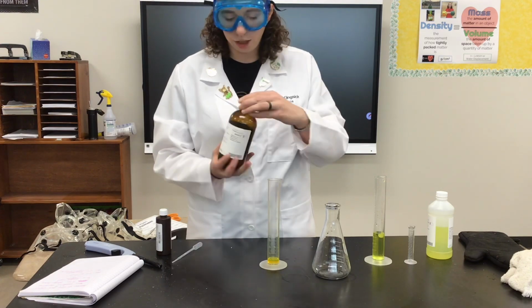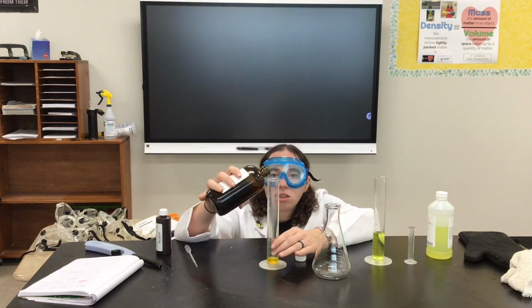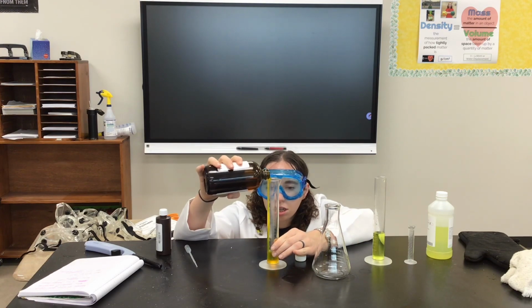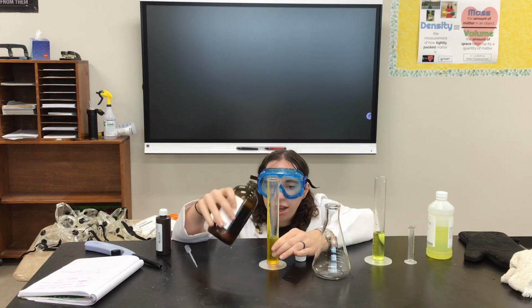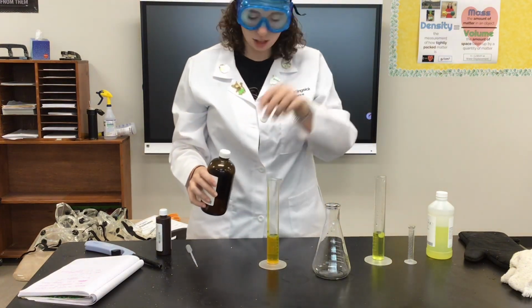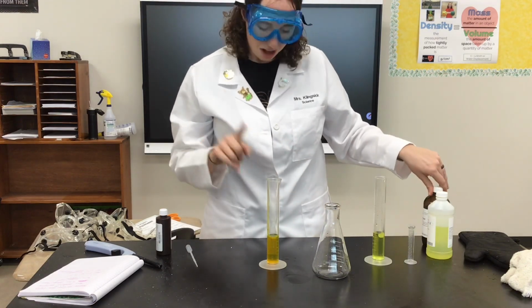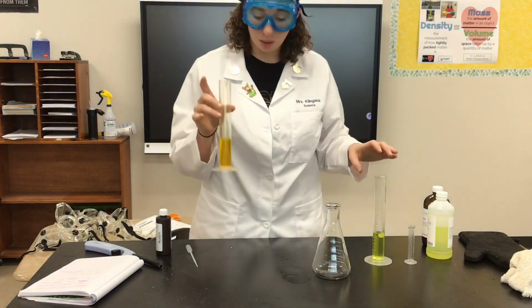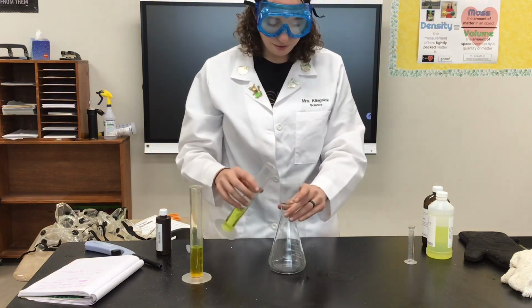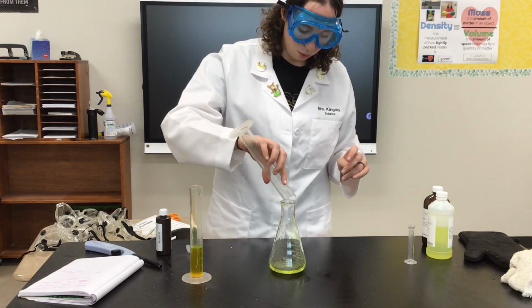And then in my other graduated cylinder, I'm going to be adding this energetic light solution. I'm going to add 35 milliliters of that. You can kind of see it's much thicker. So if we compare it to this one, which one is going to have a higher density? Hopefully you said this one because of the thickness. This one is definitely more dense than this one. Okay, so I'm going to add this into my flask. The flask is going to be used as a good mixing tool.